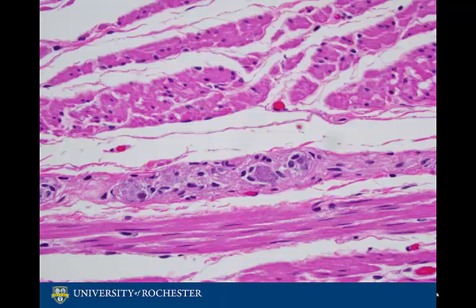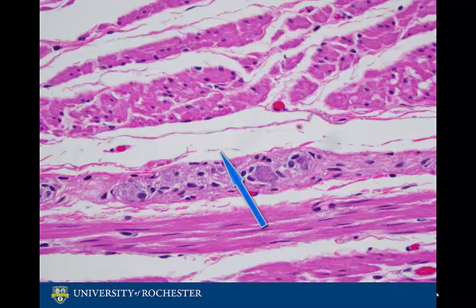Here we see the muscularis externa with ganglion cells. These ganglion cells are part of the myenteric plexus, the main nerve supply to the gastrointestinal tract.